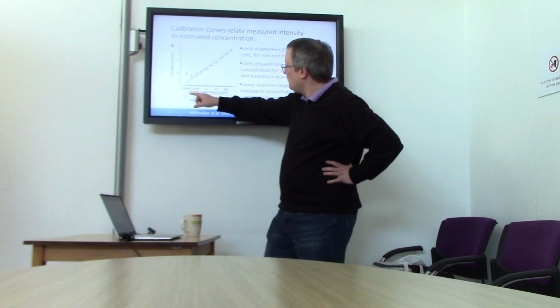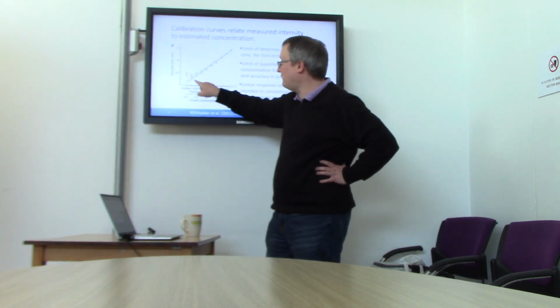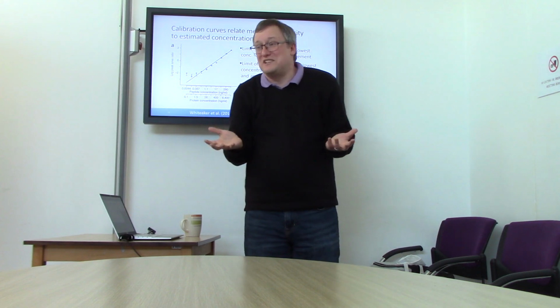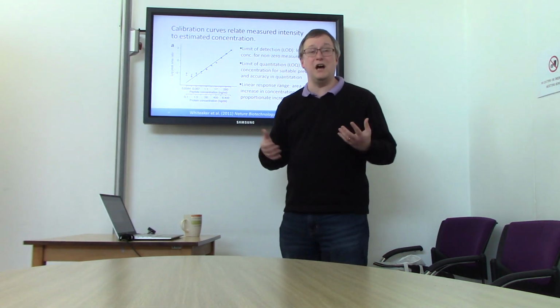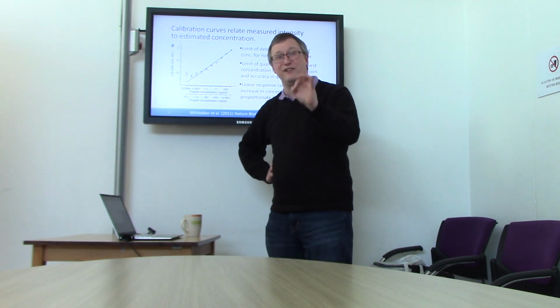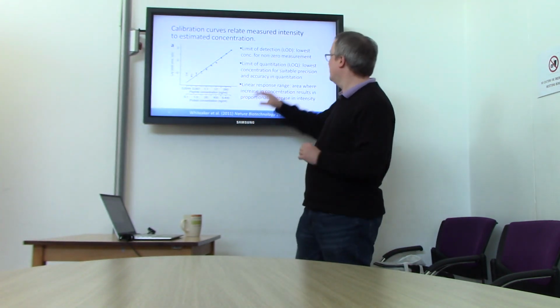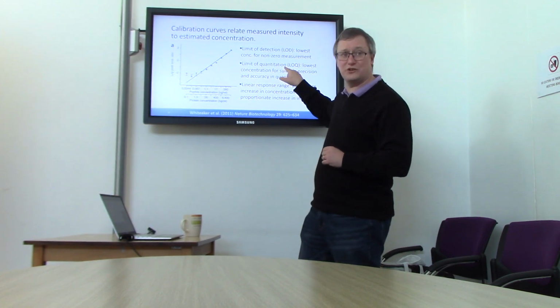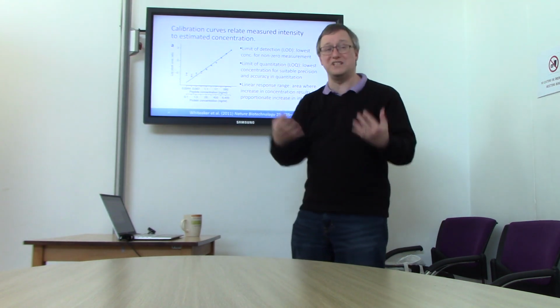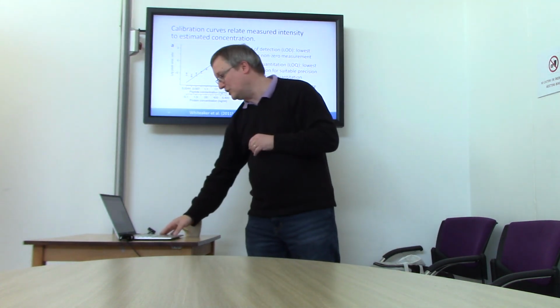And for that, you really need to go the route of a quantitative experiment and construct something like this calibration curve. Here we're seeing that even though the known peptide concentrations coming into this experiment have fallen and fallen and fallen, we're still measuring intensity for them, even though they're not actually present in the sample at the lowest level. This is pretty common. Remember that I said if you're simply integrating what you find where you expect to find the peptide, you might find a peak even if that peptide is absent. So you might get a little bit of intensity measured even when the thing is absent altogether. This tells you a lot about the limit of detection and the limits of quantitation. These are concepts that show up again and again. I've talked about them in other contexts as well, but in the case of quantitative experiments, being able to understand whether you are in a range where you could accurately quantify a given peptide is certainly a big deal.